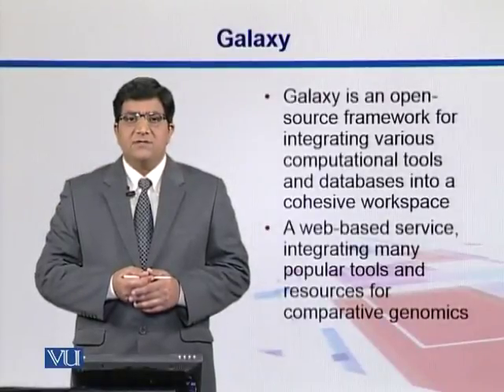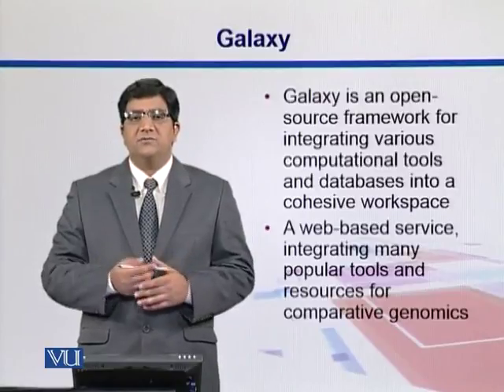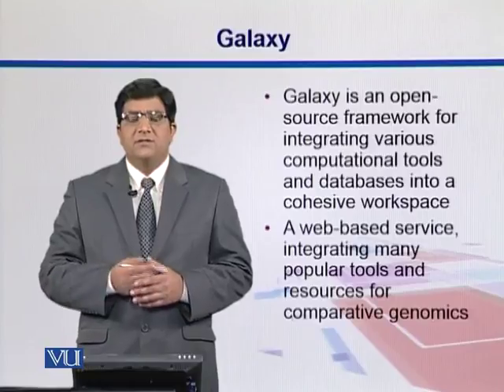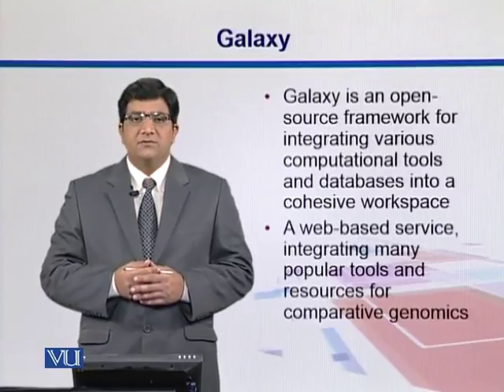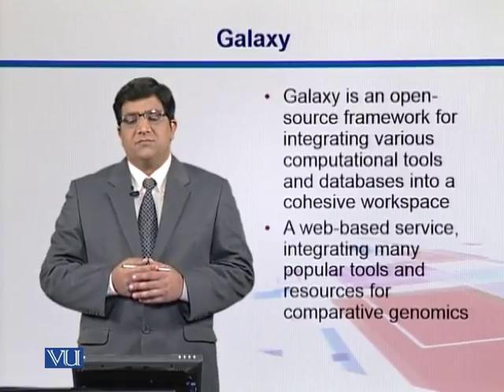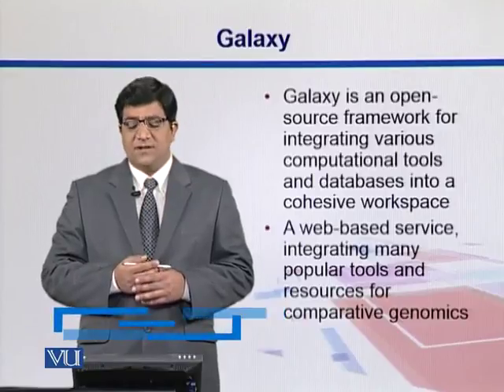Okay guys, so let's do some data analysis. At first we will go over an online tool called Galaxy. It also has a standalone application, but later on I would expect you to go through these softwares using your Linux commands, which we will cover in the later half of this course.